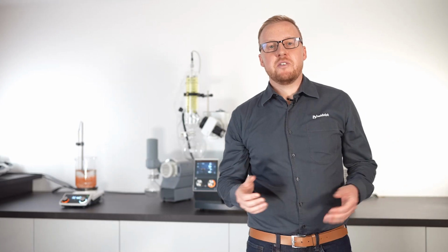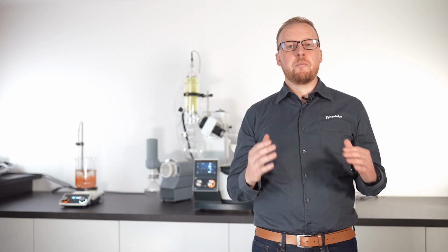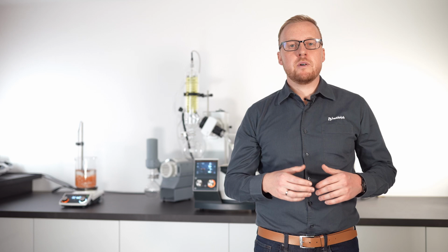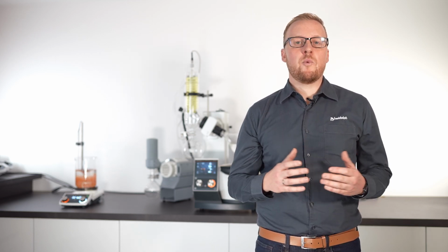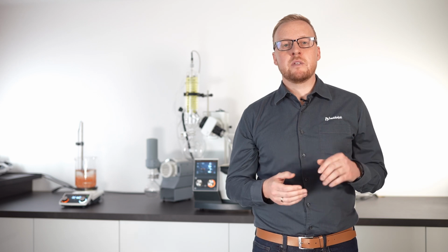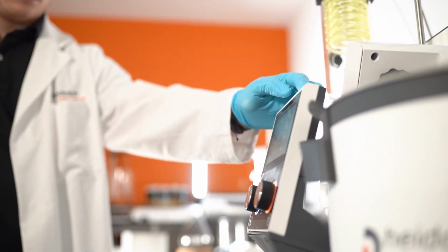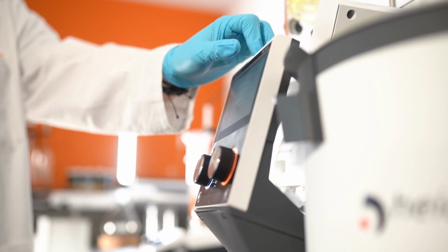So, summarizing, you saw that the Dynamic AUTOaccurate function allows you to run an evaporation process on a perfectly balanced and most efficient level without the need of monitoring. You can invest this time into other research tasks. Moreover, due to the very sensitive step-by-step evacuation process, it can avoid foaming and bumping, and it addresses and finds the boiling point automatically. If you are interested, our application specialists are happy to assist you and to check which improvement potential the DAA mode offers for your specific application.